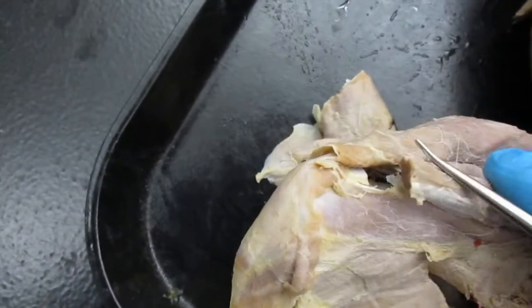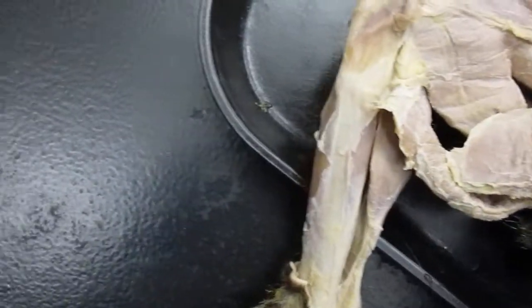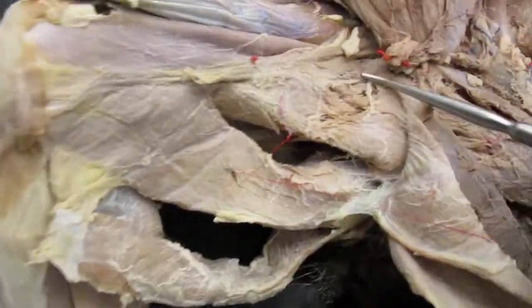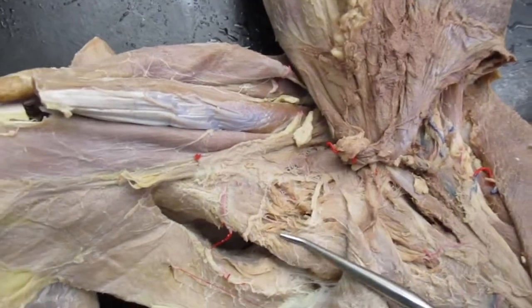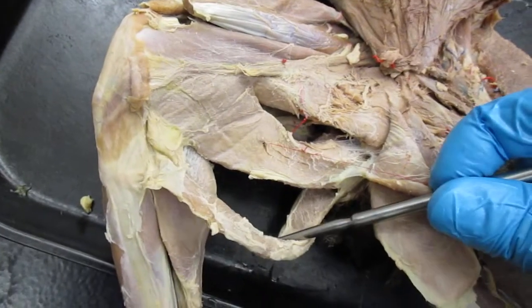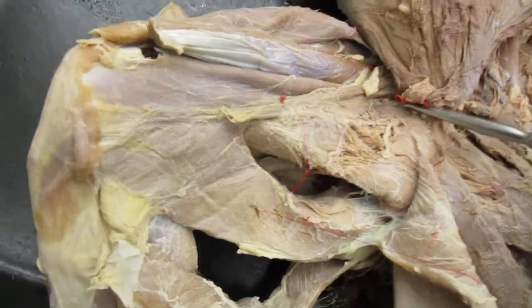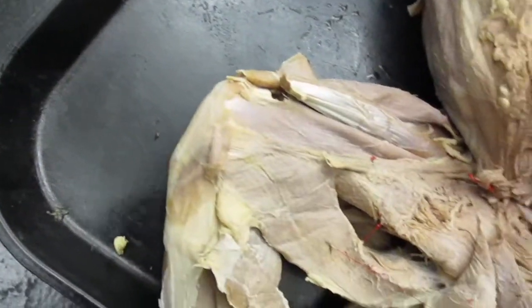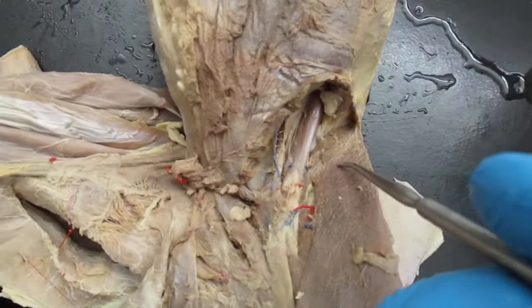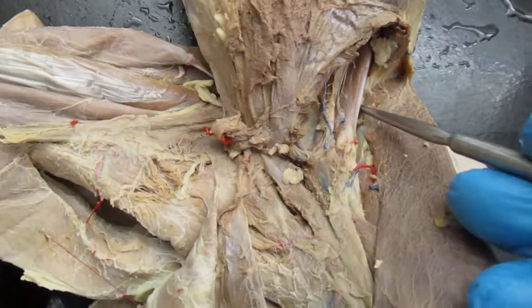Okay. We have the adductors. I've already showed you those. So let me show you this again. We have the adductors right in here. Didn't turn out that good on this cat. Remember, we have the semitendinosus, semimembranosus, the adductors. Pectineus would be right in here. And then I want to show you the iliopsoas. So I had to cut through some stuff here up into the abdomen area to show you the iliopsoas muscle.